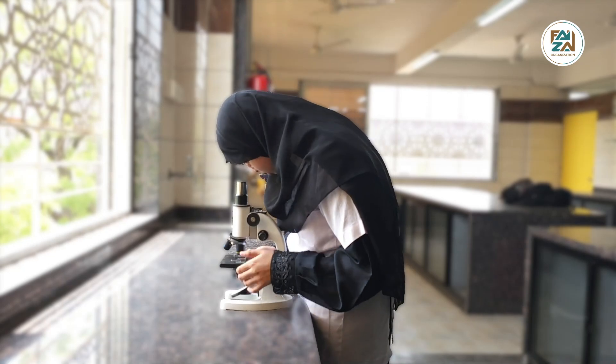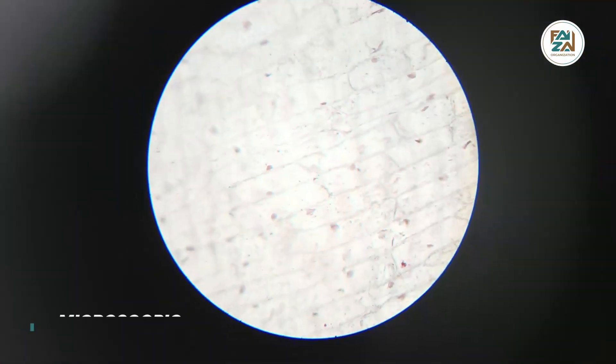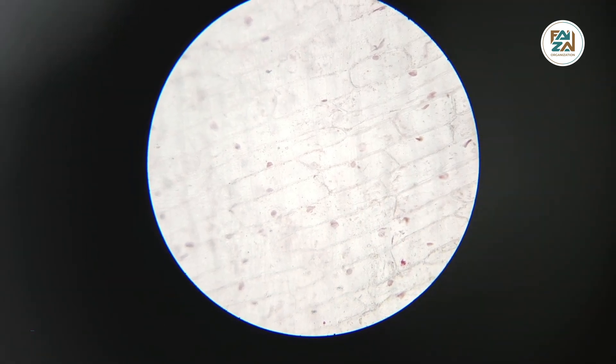We can observe the stained nuclei of onion peel under the microscope. The whole experiment was about the staining of nucleic acid by aceto carmine. We can see in the experiment the peel of onion and the nucleic acid. It is the main biomolecule of our body. In our experiment we saw different types of biomolecules, but the nucleic acid is the main biomolecule, and our aim was to see the nucleic acid.